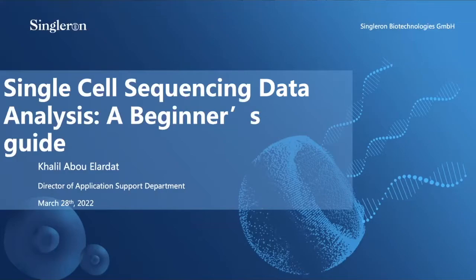Maybe we'll give a training also in the future, but for now there are several tutorials also from people who wrote Seurat that go step by step what to do, how to load these count matrices and how to do the quality control and analysis. But for now, we are only going to stick to the basics. So going from the first step, getting the raw data out of the sequencer, up to generating your count matrix with which you can work.